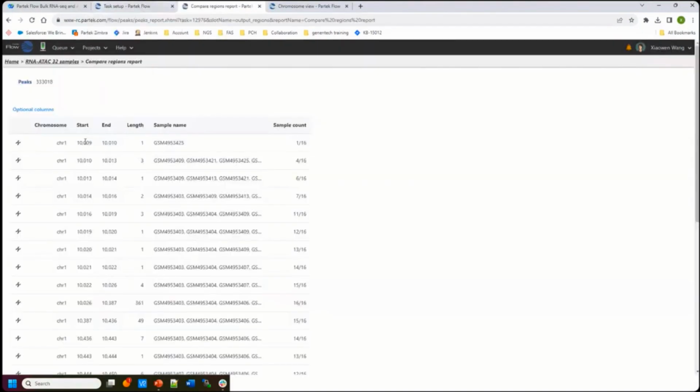And here you can see the stop of this one is the start of this guy, right? This one, the stop is the start of this one. So suppose this is really one region, or eventually, if I go over here, probably all this is one big region. Suppose I cannot select it from here to here, I think it's one region. Instead of looking at 361 base pair, I want to look at like a 380 base pair. So you can merge that.